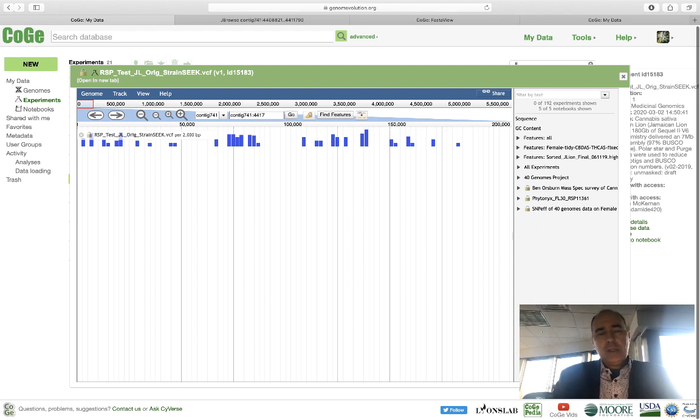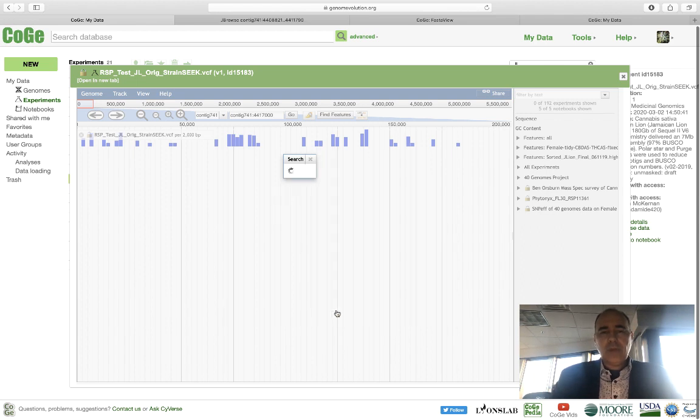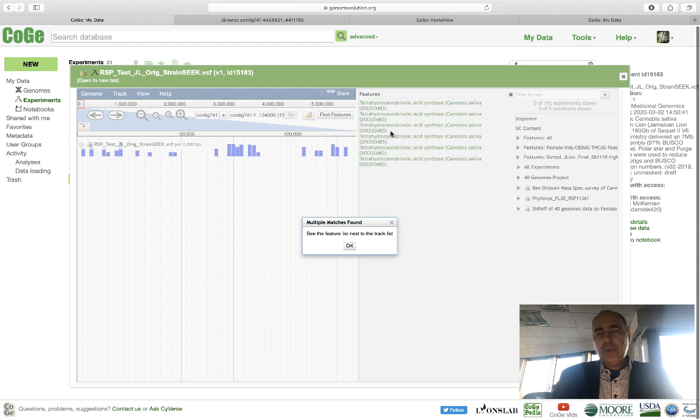4417, 000. Now, if you don't recall 4417, I have that burned in my brain, but you don't have to have it burned into your brain. You can just go up here and say, I like THC, tetrahydro, and search. Oh, I forgot to check all of these, and then hit OK, and it will come up with a list of all the different THC-like genes in the contig.